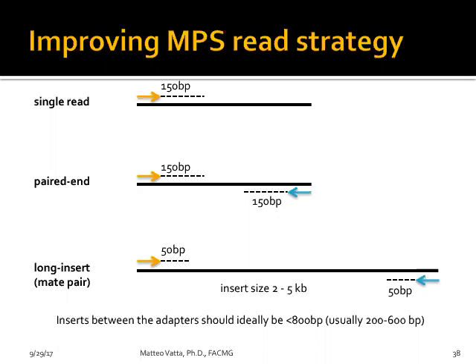So the paired-end technology came to the rescue, and right now the most common read length used clinically is 150 base pair paired-end technology.